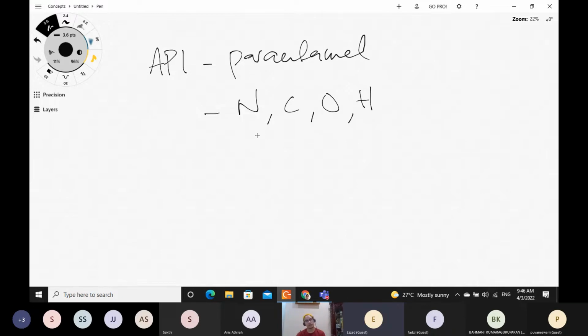So maybe dia ada certain preference lah untuk absorb a certain wavelength of light. So katakanlah kita tahu, kita test lah all different wavelength, dia absorb paling banyak dekat mana. So katakanlah dia absorb paling banyak dekat 270. So kita boleh gunakan this behavior untuk kita kenal pasti.